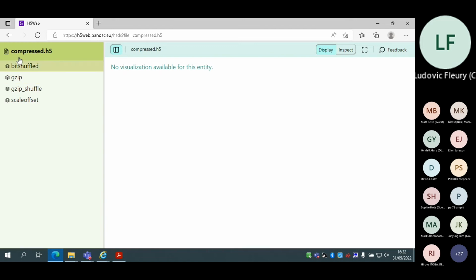The development that we needed to do at ESRF was to support the Nexus ontology. And we don't use compound datasets at ESRF. But if you think that you have a use case to plot compound datasets with one field with respect to the other, then get in touch and we can develop something for it.